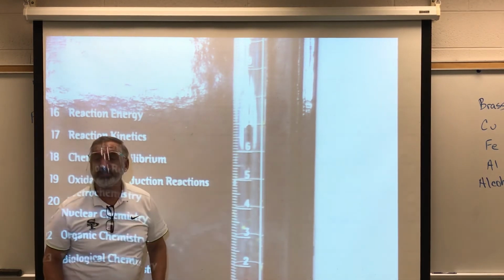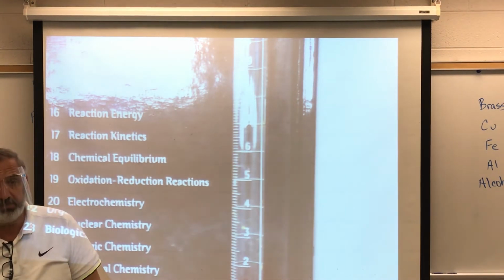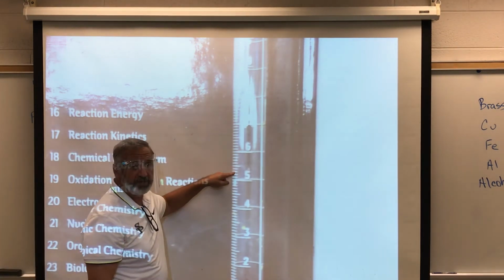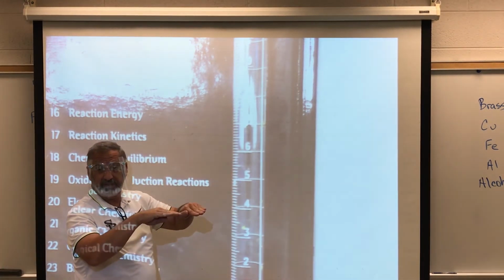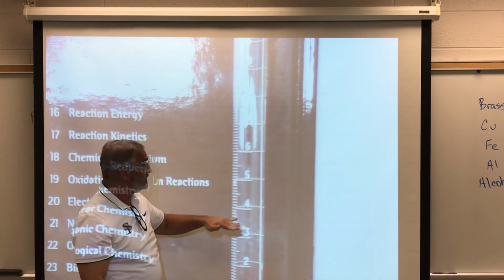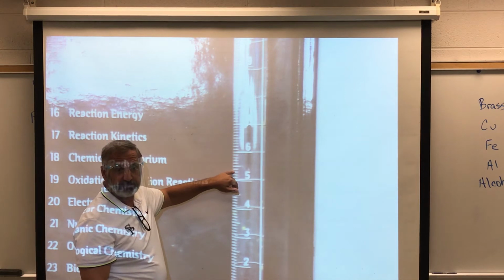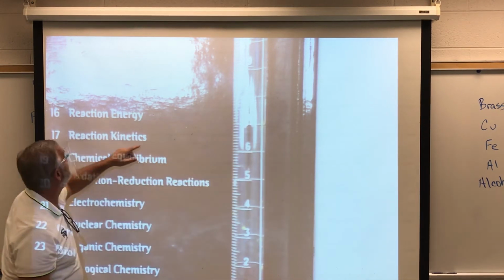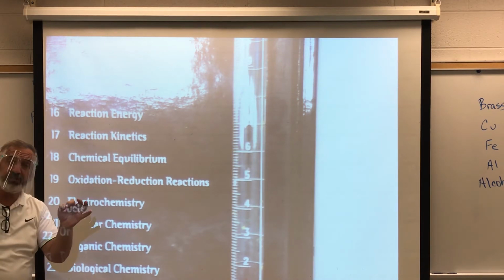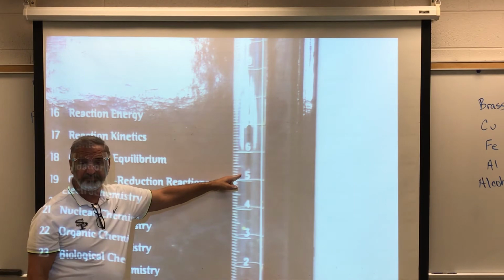So how many places do we measure this to? 2 decimal places, 1 past. If it's on the line, it's a 0. Now these lines are pretty close to one another, so if it's on the line, it's a 0. If it's in between the lines, we go to the 5. Okay? So we need to make sure we always measure to the proper degree of accuracy when we're measuring out. So you're going to measure, it says 8 milliliters. You don't have to have exactly 8, you just need to know exactly how many you have. Read it exactly off your graduated cylinder.